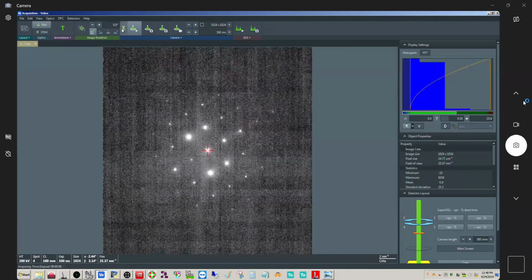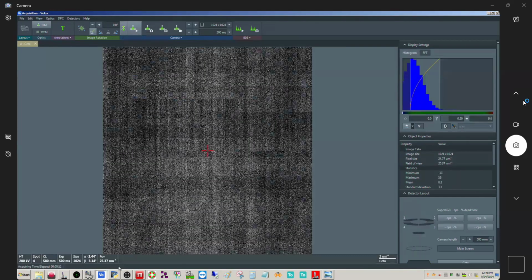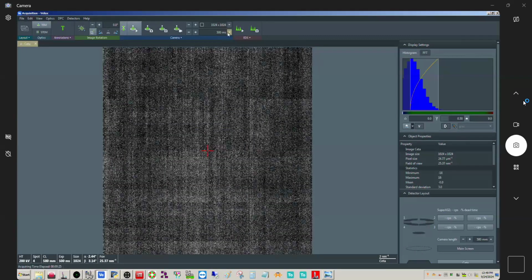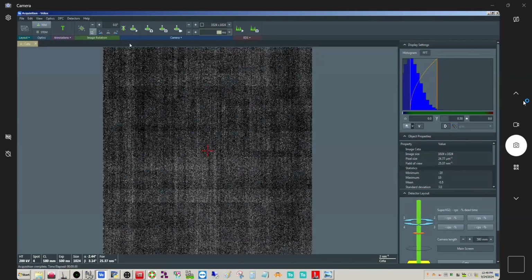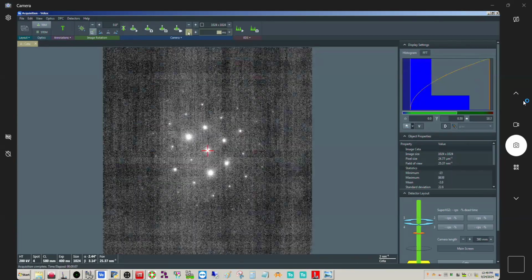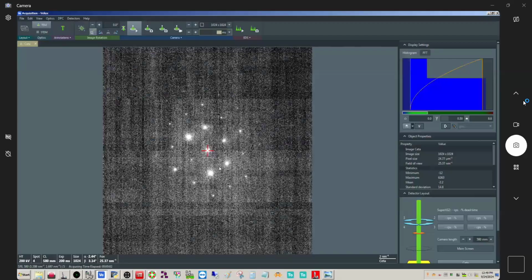All right, let me go ahead and blank the beam here. Now this is actually giving me a little bit high of a reading, and it's still giving me a high number. So I'm going to put this back down to 400 milliseconds. Let me unblank. Okay, all right, I'm going to drop this down to 200.